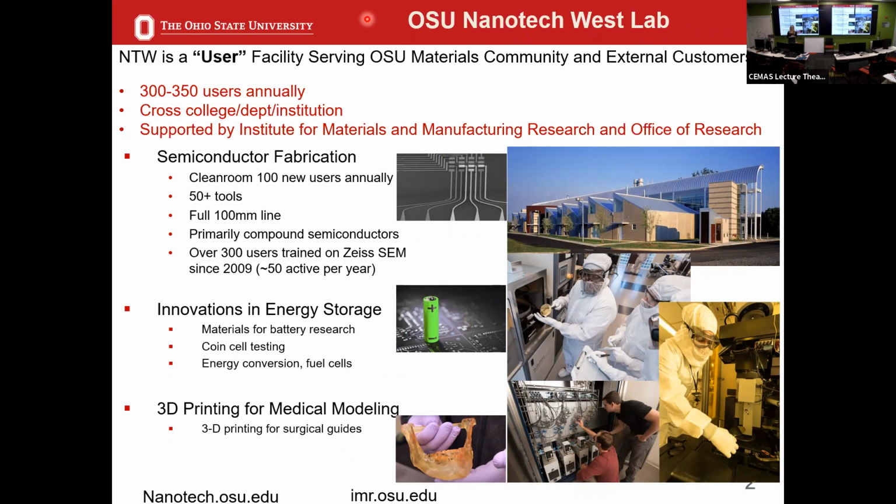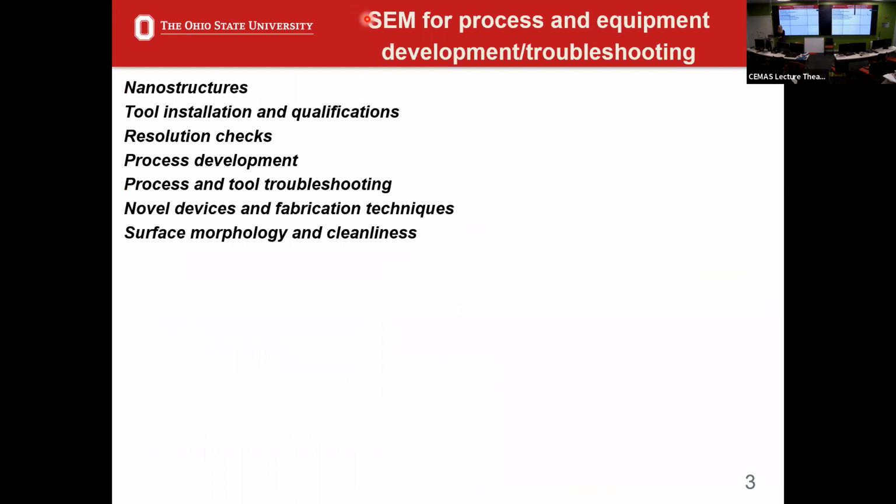These are people who are using the microscopes as a tool to evaluate their processes, their fabrication, and in some cases, their devices. I'm going to skip through the other ones, but we also have a significant endeavor in energy storage. We have battery research, battery innovation going on, and there's also a medical modeling facility in Nanotech West. Okay, so quickly, some of the things that I'll talk about today and why we use low kV SEM.